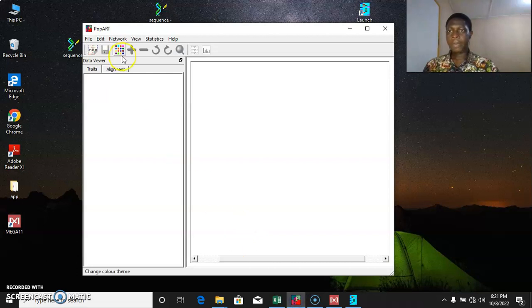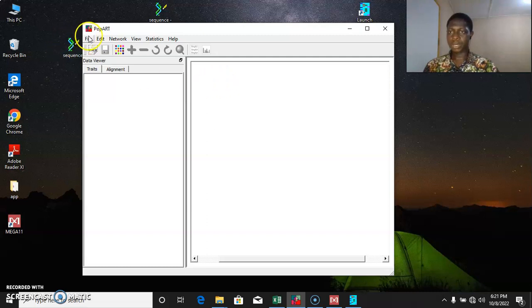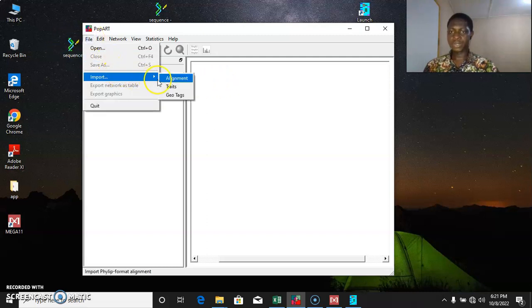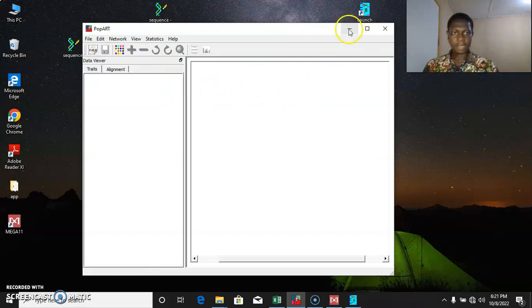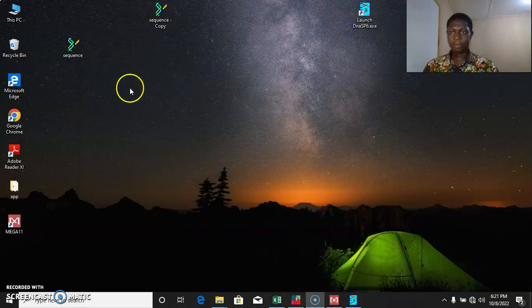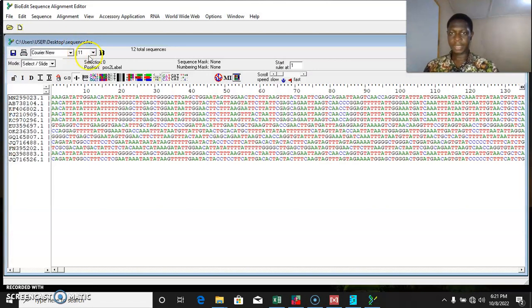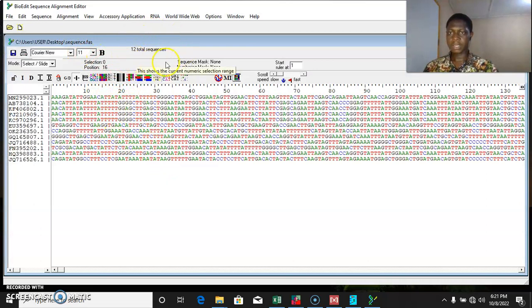So this is the PopArt software. In order to build the network, we essentially need two files: we need the alignment file and the traits file. So let's view these files. We have our sequences here — we have 12 sequences in all.